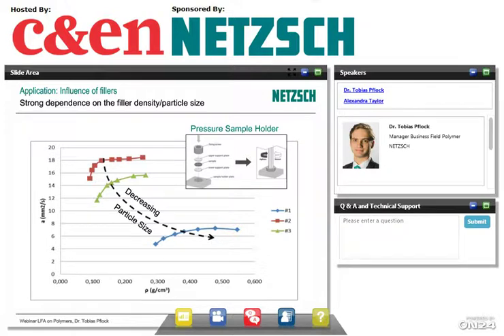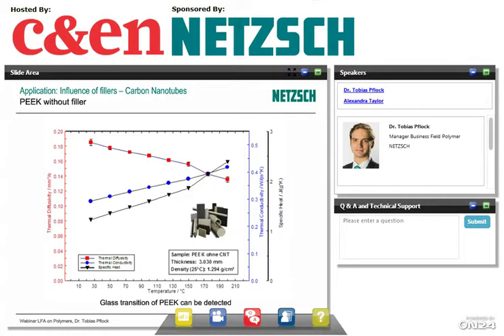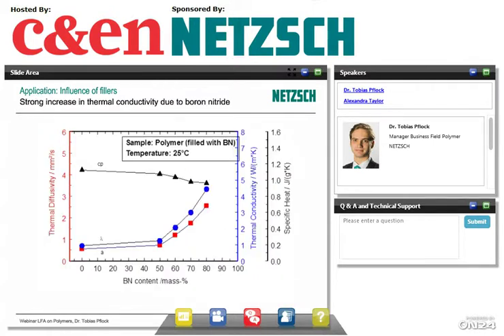Well, that was just an example of pure filler, but now we want to look at polymer materials that are used with some filler material. Oh, sorry, I was too fast. Let's go 1 slide back. And this is an example where boron nitride filler was used to adjust the thermal conductivity of a plastic material. Again, you see thermal diffusivity on the left, thermal conductivity and specific heat on the right, and the x-axis shows different contents of boron nitride in our samples.